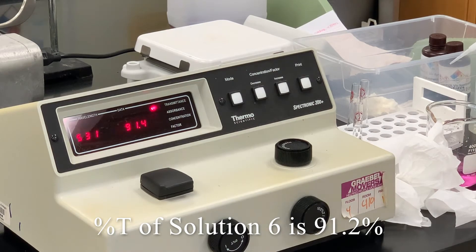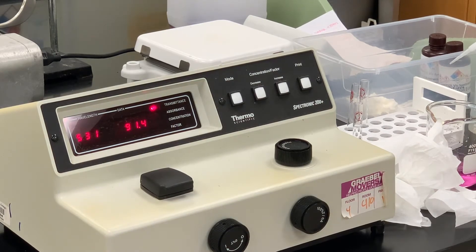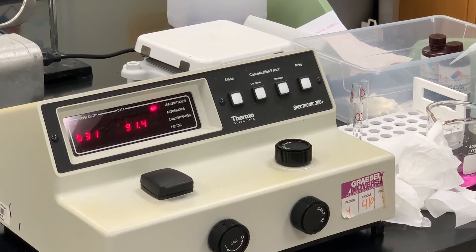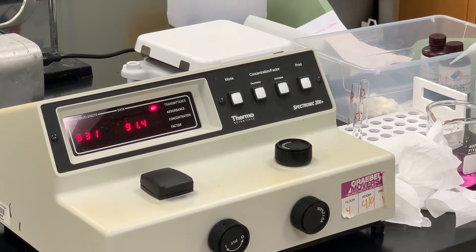I should also say that in terms of using the spec 20 spectrophotometer, typically the best percentages of transmittance should be in the range of somewhere between 10 and 90. If you get much lower than 10 or much higher than 90, it's not quite as accurate.